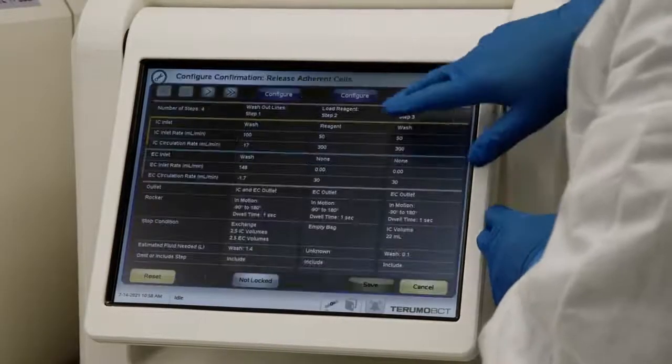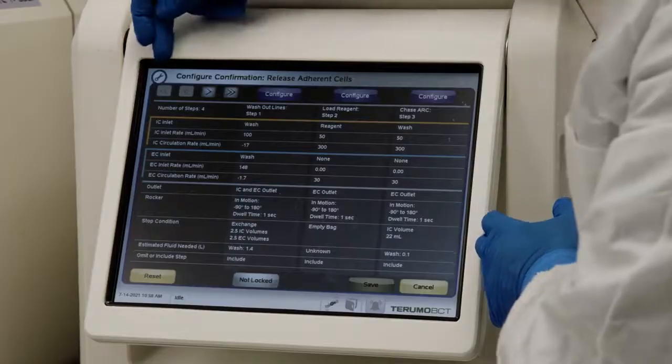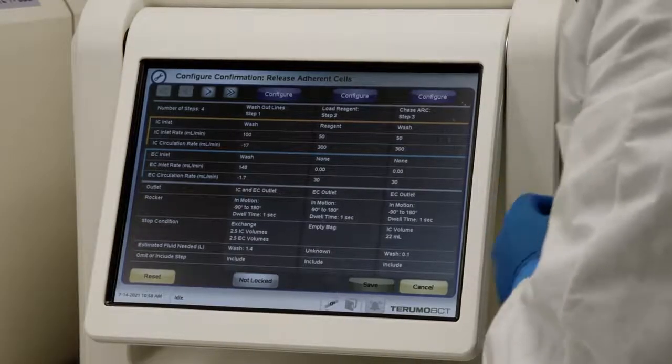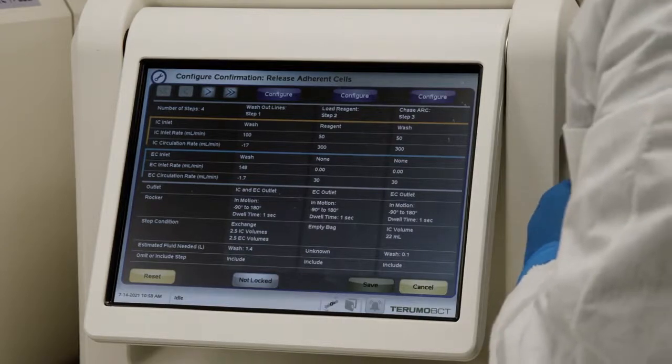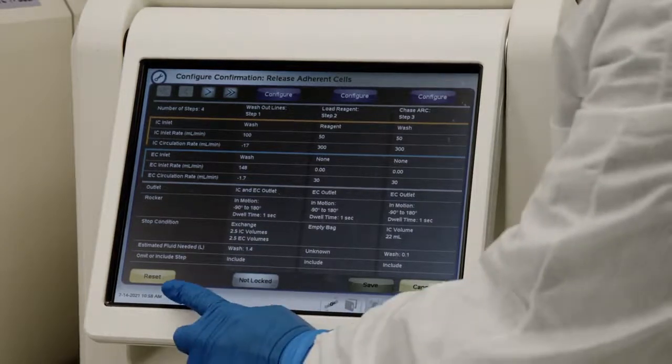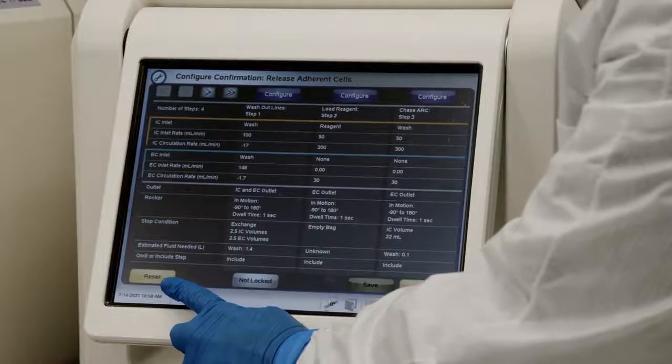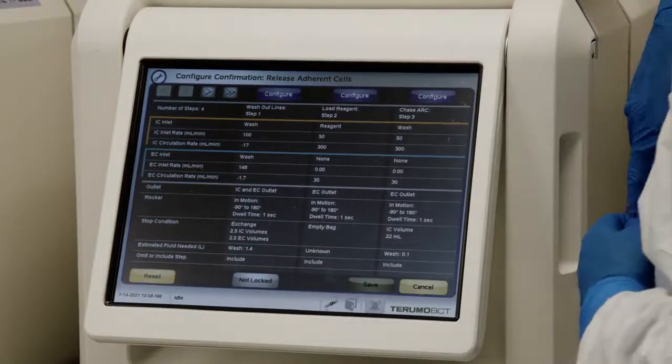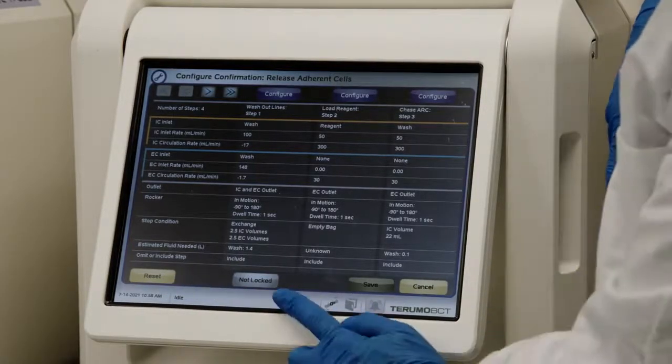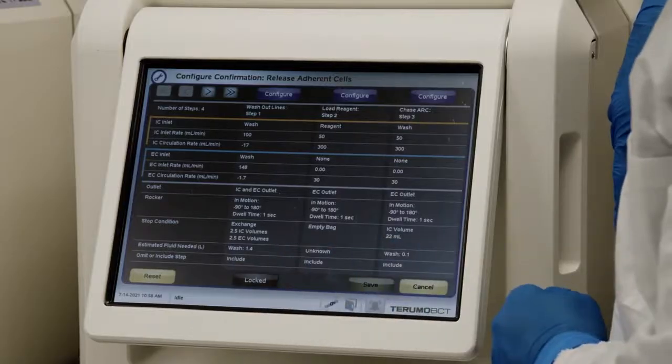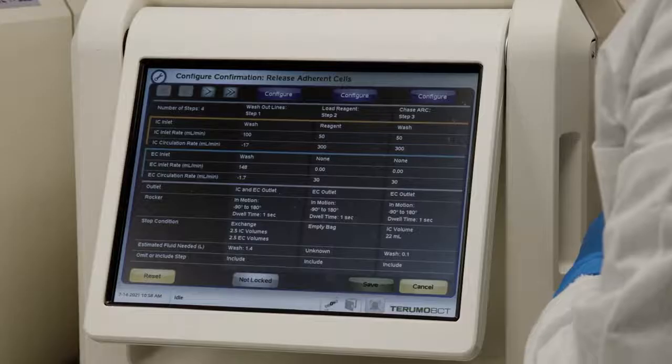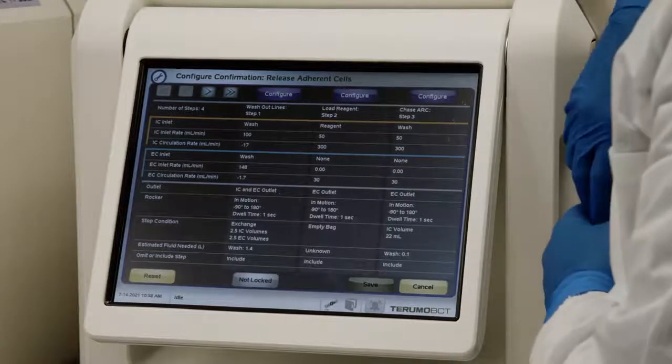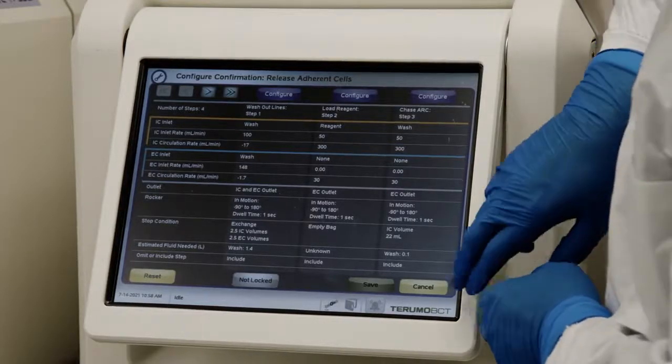On this task settings page, you can see there's a purple button here which is labeled configure and any changes that will be saved here will become the new default task settings. However, you can reset these back to factory defaults by pressing the yellow reset button. Additionally, you can lock these settings such that the operator will not be able to change them when performing a task. Therefore, Quantum is going to be really flexible for your process development needs, but can be locked down with set protocols for GMP operations.